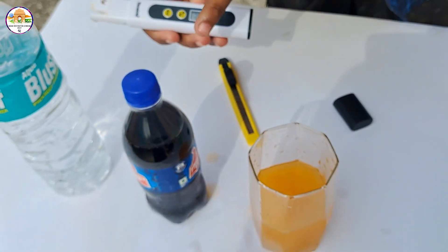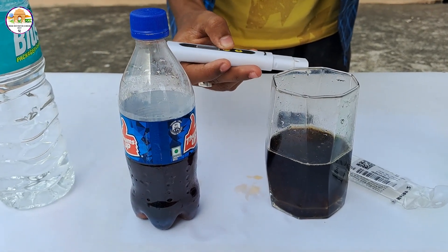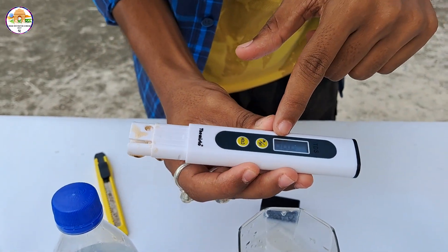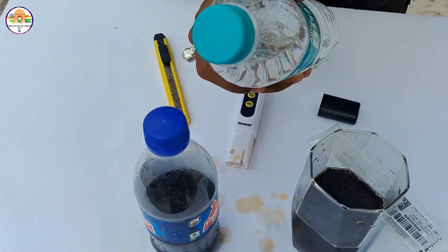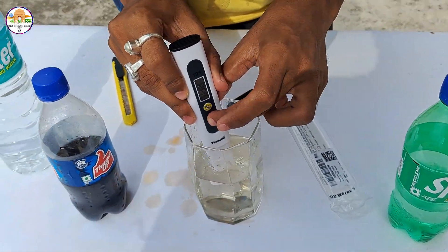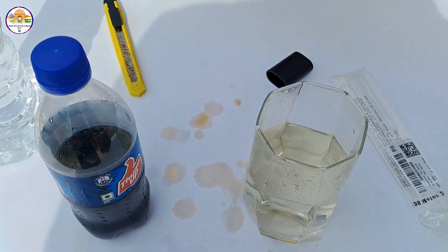The next one is to test the Thumbs Up. We check the TDS level — hold this one. The TDS level reading is 396. Next, we will test the mineral water TDS level.